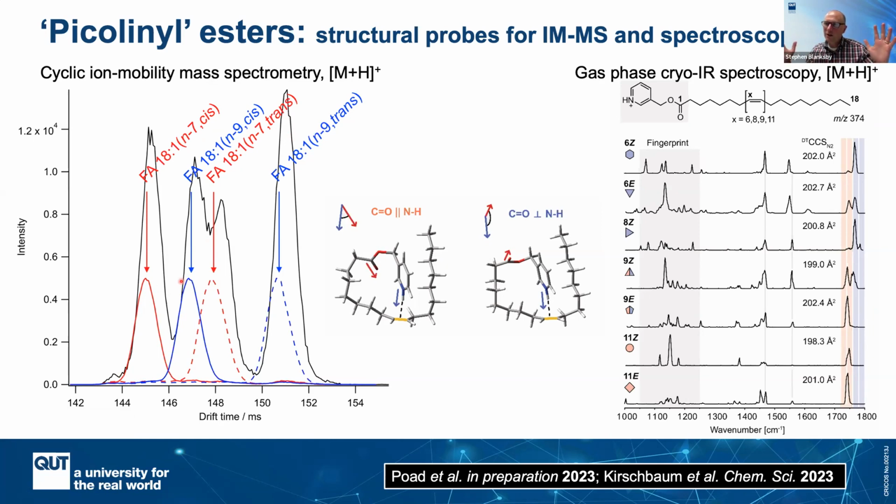So these are preliminary data, but what looks really promising is the ability to have some sort of complex lipid separation on the front end by chromatography, maybe mass selection, break the molecule down, look at the fragments by mobility, and then interrogate those fragments by ozonolysis. Or even photodissociation. Bringing all those pieces together would be a super elegant solution in terms of providing a top-down structure elucidation and leaving very few questions unanswered about how many isomers you have and what their structure is. So yes, very excited about ion mobility. I wouldn't want you to go away thinking that I was poo-pooing it in any way.